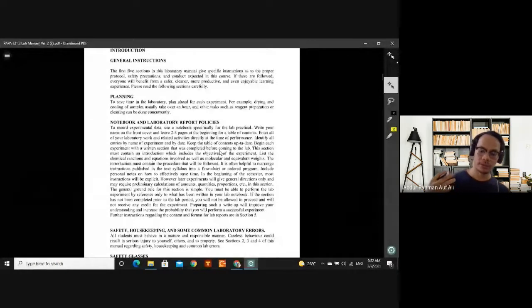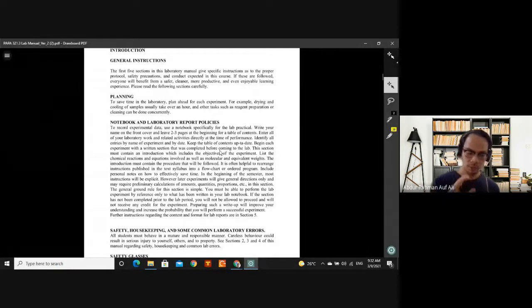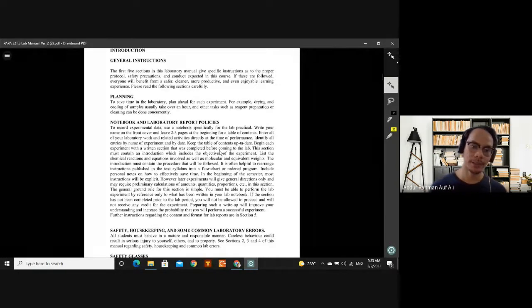So kamu perlu pakai lab coat. The purpose of the lab coat is to protect yourself because the material of the lab coat adalah tebal. It is supposed to be long sleeve. Okay, tapi dekat dalam KPGC dia pakai 3/4 short sleeve. I don't know why. Okay, so I have no say in that. Tapi sepatutnya if you work in laboratories, dulu saya kerja dekat dalam lab, all our lab coats are long sleeve, all have to be buttoned down. The purpose is to protect ourselves.